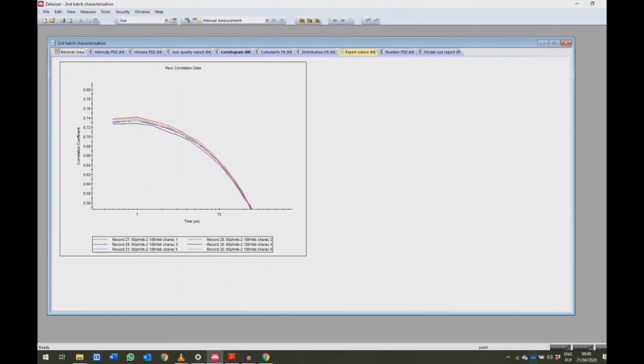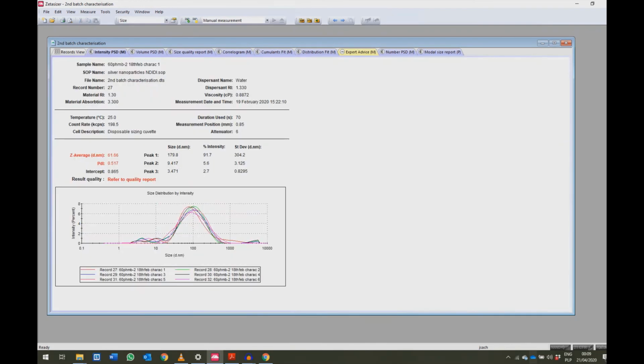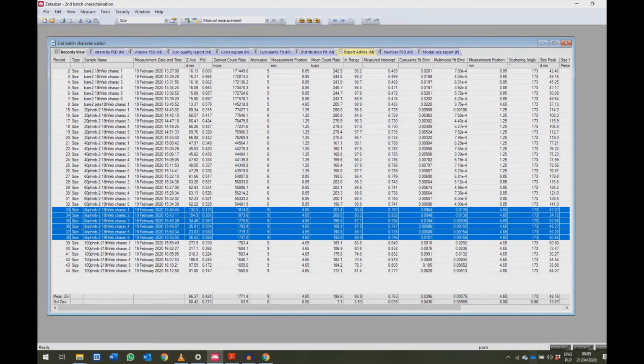So it's worth looking into this in more detail as well. The big peak, you could probably call it pretty much the same. The small peak is getting more complicated. So there are some patterns in there that you can discuss. Obviously, the further you go, the more hectic it gets, really.